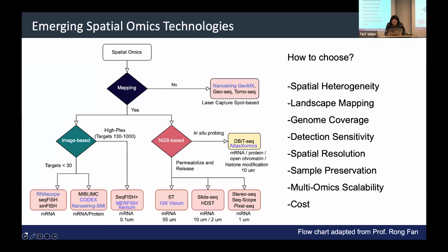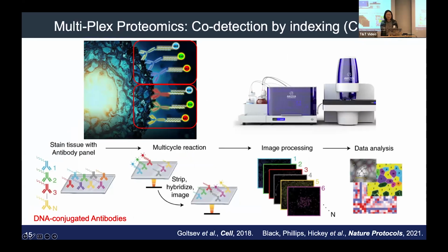There we use a method called spatial proteomics. This is a method where we're using multiplex primary antibodies that are conjugated with DNA barcodes. Each of the colors here represents one specific primary antibody. And Dr. Garry Nolan's lab from Stanford University designed a special chemistry to conjugate 8 to 12 base pair DNA oligos to the antibody with covalent bonds. So it's a very irreversible binding of the barcode and the antibody.